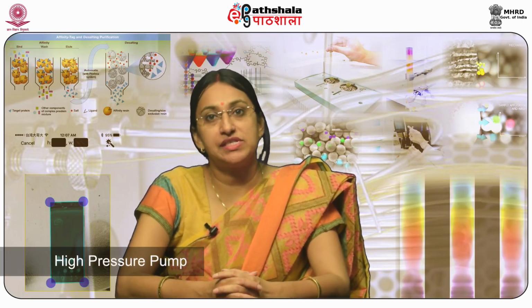High pressure pump. A high pressure pump is enabled to aspirate the solvent or mobile phase from the solvent reservoir and forces it with pressure through the injector, column and detector. The mobile phase has to pass through the stationary phase inside the column, which may consist of a compact bed of adsorbent material or ion exchange resin or a microporous packing material.